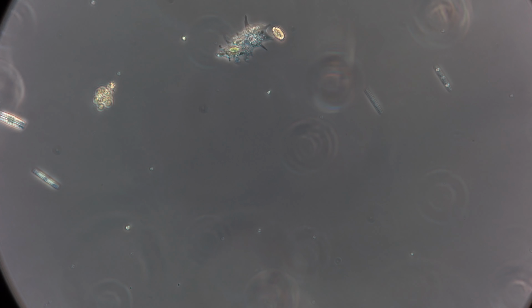Almost good. Okay. So I concentrated all that water to this. Oh wow, all of this. Okay. So what's in there? Little person. And you can also look at it with fluorescence.